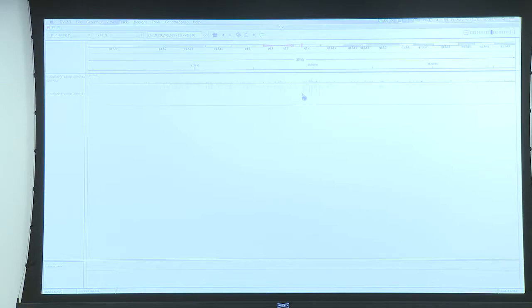But this is not such a comfortable way of viewing it. For instance, this is a really good area. You see it has several reads aligning to it. The TDF, which you will generate soon, is a better way to view it. But I also wanted you to see how the raw reads look on the IGV, which I think is really nice. It gives you the directions and so on.